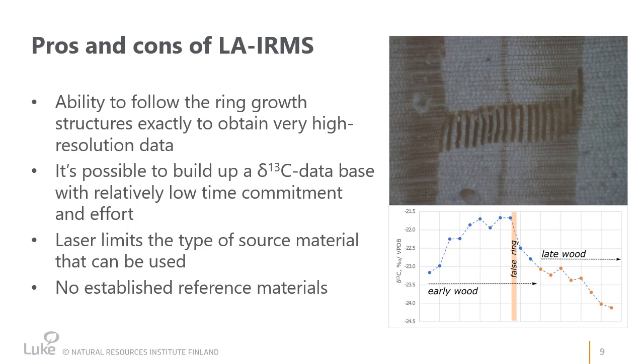And these powders have been pressed into pellets using a hydraulic manual press. So with this method, you obtain a sample that can be ablated similar to your unknowns and used to correct the stable isotope data.